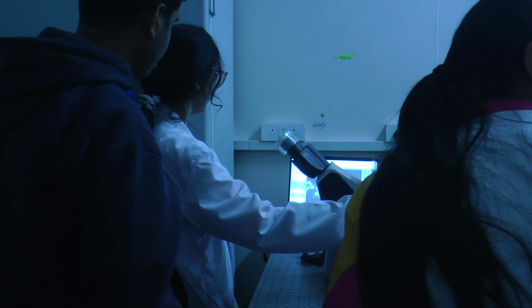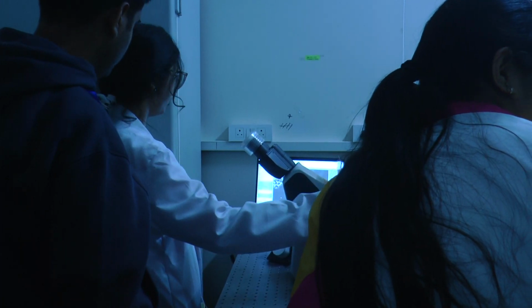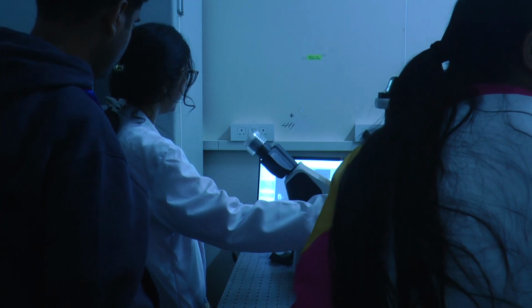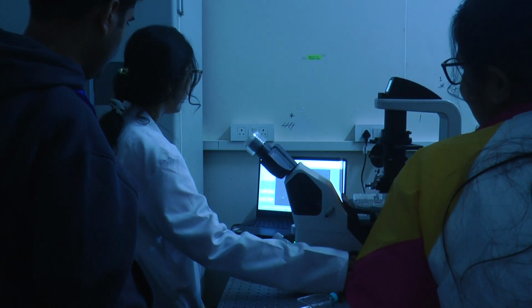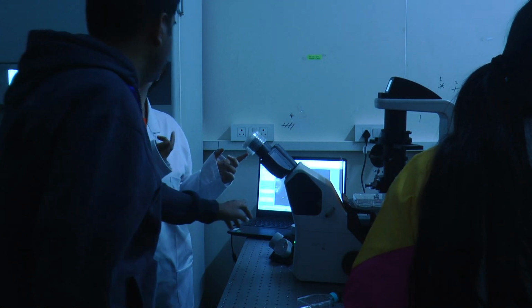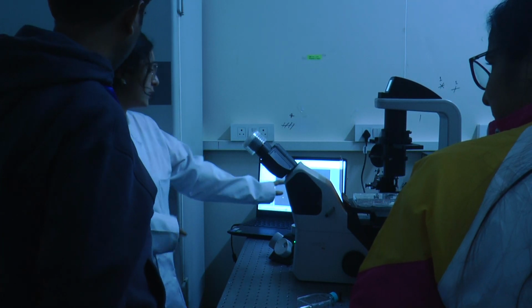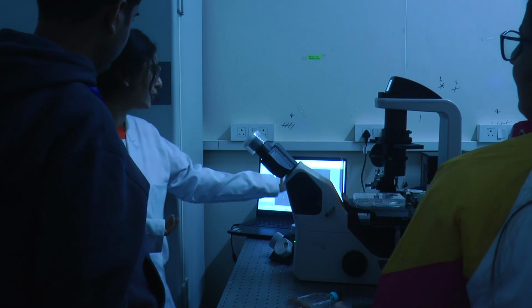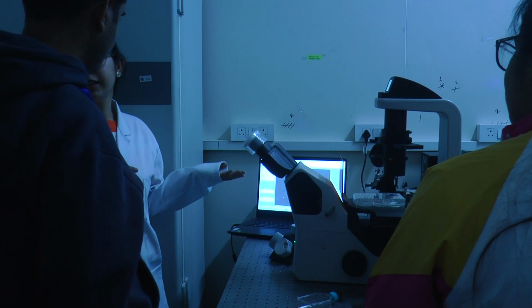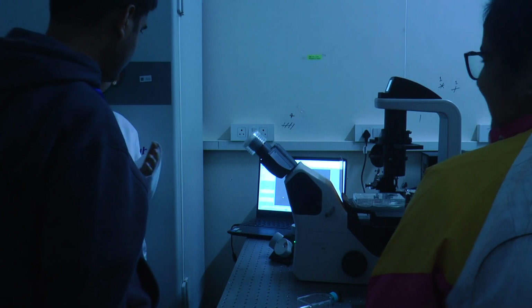How do you find the radius after taking it? Yeah, from imaging. We'll take the images, which are isolated completely. So I take phase contrast images, or I can even add some membrane dyes. It goes in that membrane also. Anyway, this will also be dead after some time. These are also dead anyway. When the cell starts blebbing, it is dead. Even if we don't add anything, if the cell is going to die, it starts blebbing.